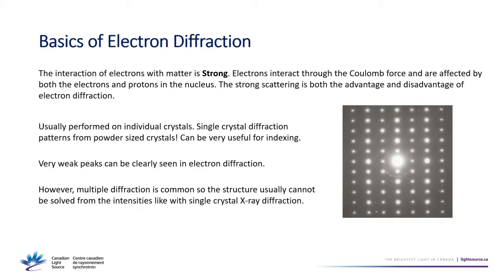If you have thin crystals and some simple samples, people have started to work out how you can actually do a full structure determination from electron diffraction, but usually you're not actually using the intensities because of the multiple diffraction issue.